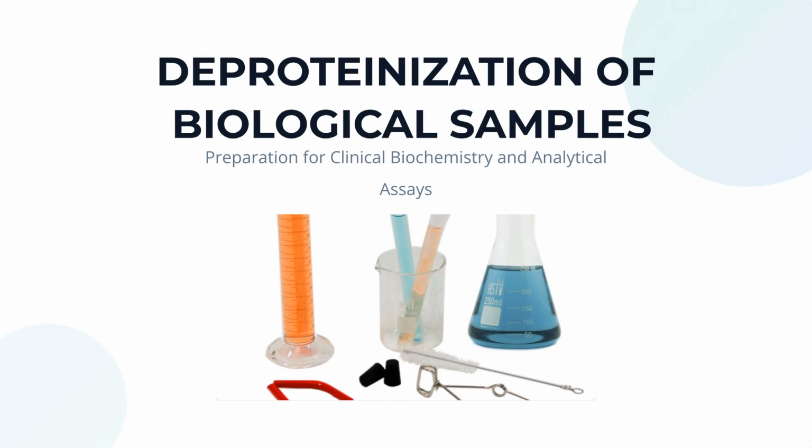Welcome to this video on deproteinization of biological samples. We will cover the essential methods for preparing samples for clinical biochemistry and analytical assays.